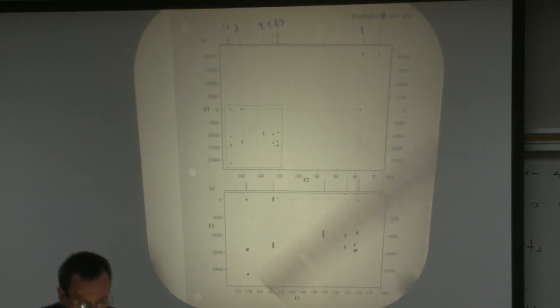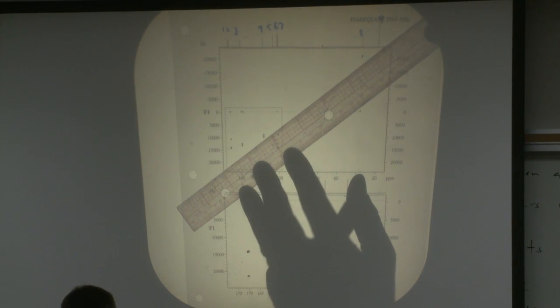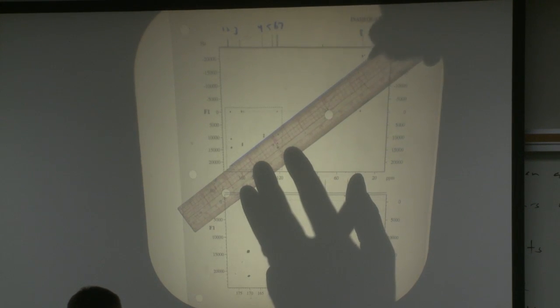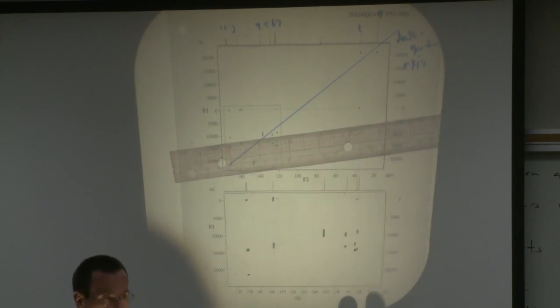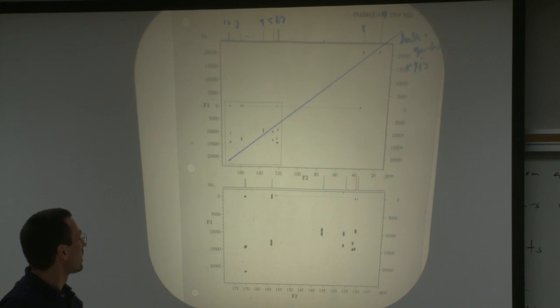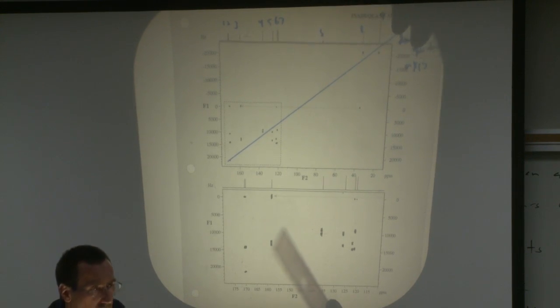You can identify your double quantum axis in addressing this spectrum. Should have 10 carbons. What? Did I miscount? This here? That's the expansion one.